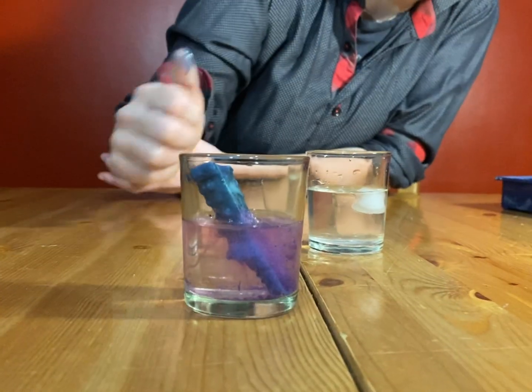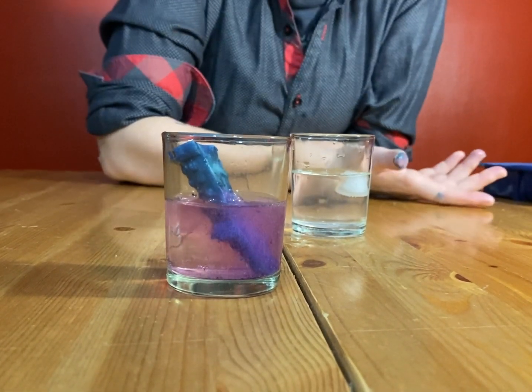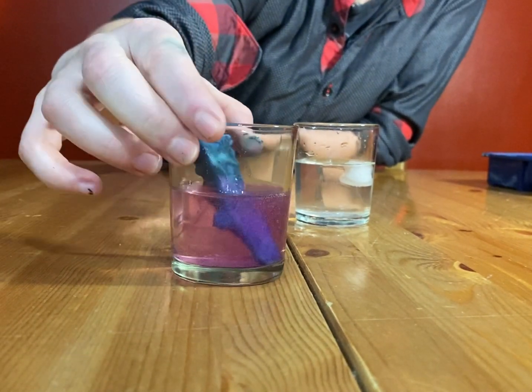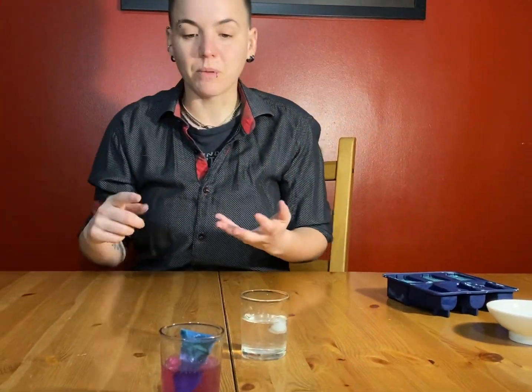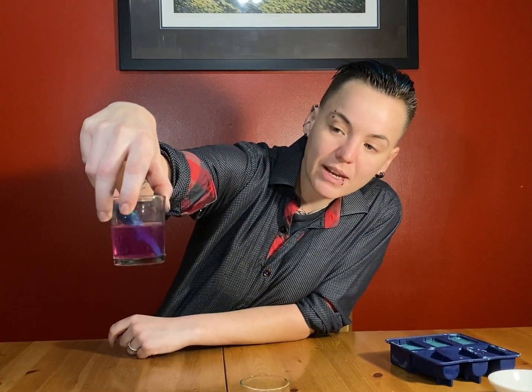Interesting. So we're getting a color change. We can clearly see that. It's turning red, right? And we're also getting gas bubbles forming. This is that gas bubble formation. So we clearly have a chemical reaction taking place. This also proves to us we don't just need one thing. We don't just need the color change, or gas bubbles, or a precipitate forming, or a temperature change. We can have a combination of any of these things that proves to us that we have a chemical reaction taking place.